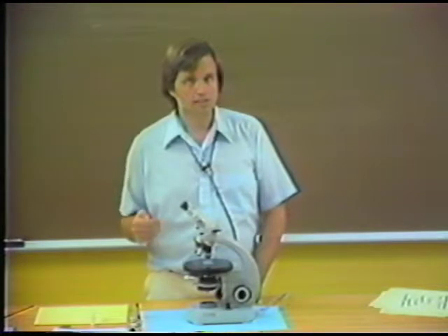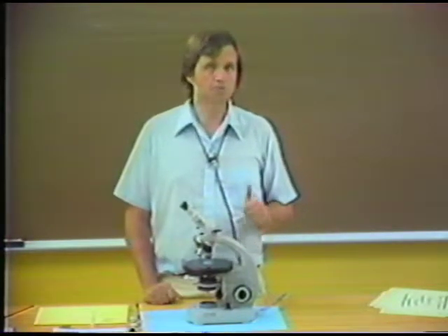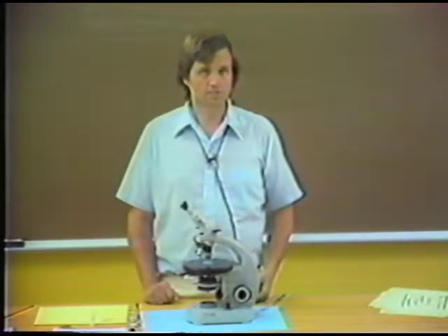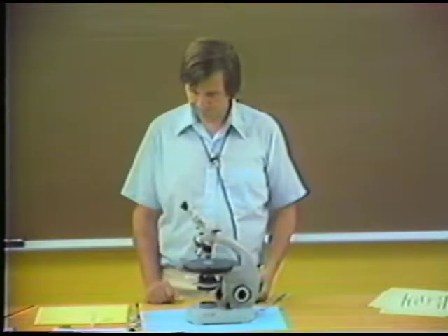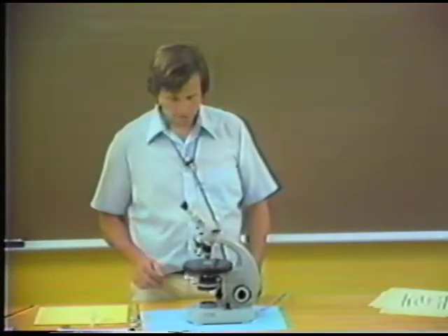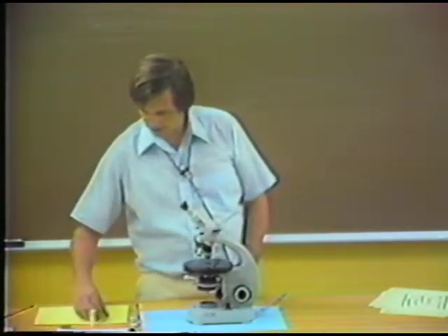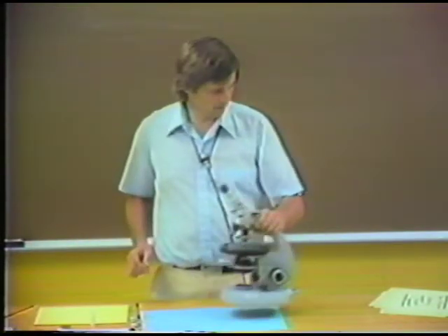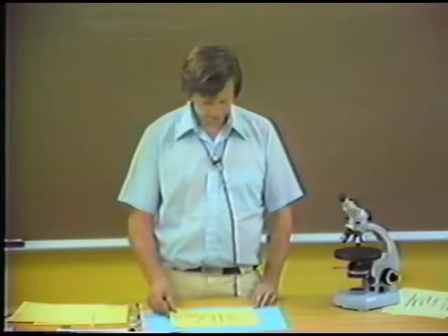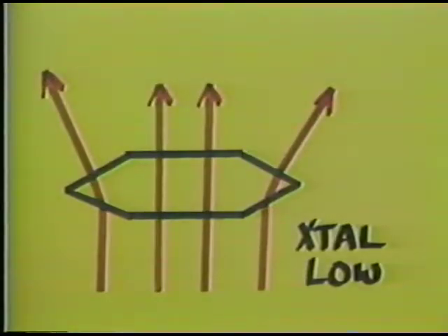And so our objective then would be to close in by continually changing the index of refraction of the oils until we can identify precisely what the index of refraction is of that mineral. And the index of refraction is very specific for individual minerals. So by characterizing the relief, it's a very, very good way to identify a particular mineral. So we've now demonstrated the central illumination test. But why does a central illumination test work? I want to give a simple explanation of why the Becke line moves in the sense that it does. And so I'll do that using a simplified drawing like this.